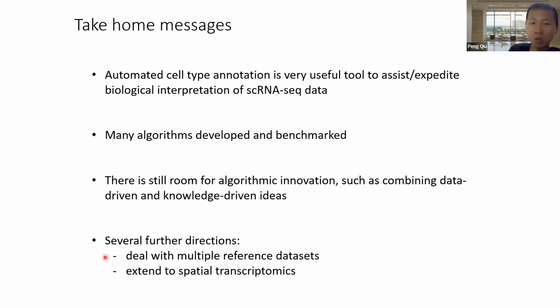Okay, so one challenge that I just mentioned is different data sets as reference, right? Their clustering analysis and cell type annotation may not be 100% accurate. And another challenge is that different PBMC data sets out there may have annotations with different resolutions.